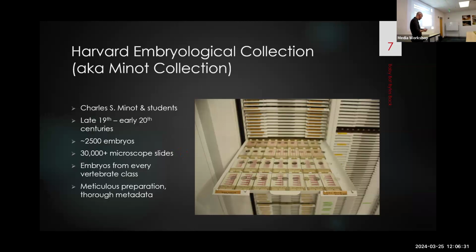Most of the series have a really nice either line drawing or a photograph, depending on the time when the preparation was done. And in either case, it's very important having that photo documentation, or the prior knowledge basically of what the embryo looked like before it was sectioned up.